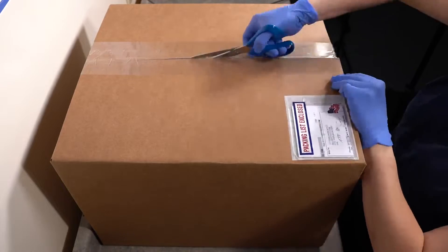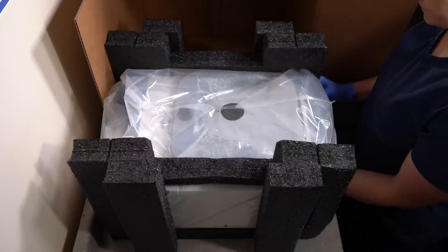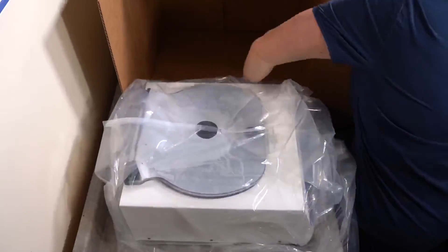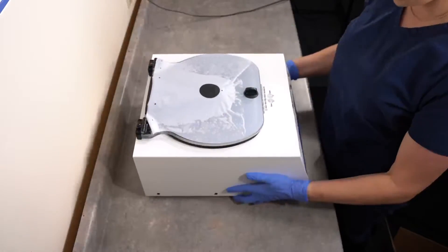To open your centrifuge box, you'll want a pair of scissors to easily remove the packaging. With your box open, you can slide the centrifuge out. Your centrifuge will come with an accessories kit — we'll cover this in detail later. Once you're done unpacking, you should have all of these items.